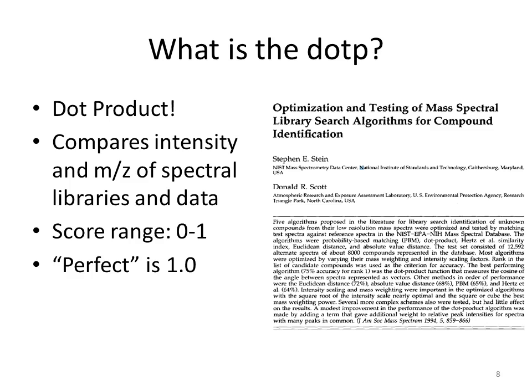So as long as your peptide is within the linear range of detection, which means it's above your lower limit of quantitation, the dot product should match, right? When you're below the limit of quantitation, what it's getting at is when you fragment a peptide, because of the way the physics work, the peptide will fragment into the same product ions under the same conditions and generate product ions with whatever intensity they come out at, the same way all the time on every version of that instrument.